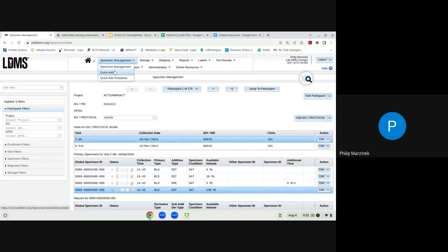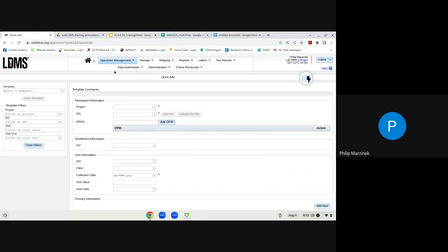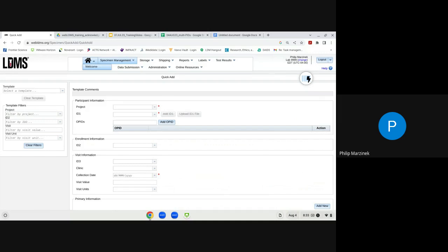We will now navigate to the Specimen Management module and the Quick Add feature, which is where we add specimens to our database. Specimens can be added a few different ways. Some methods may or may not be relevant to your clinical trial network — please review your project documentation and follow the requirements of your network. Some networks require Quick Add templates while others require manual entry; I will demonstrate both today.